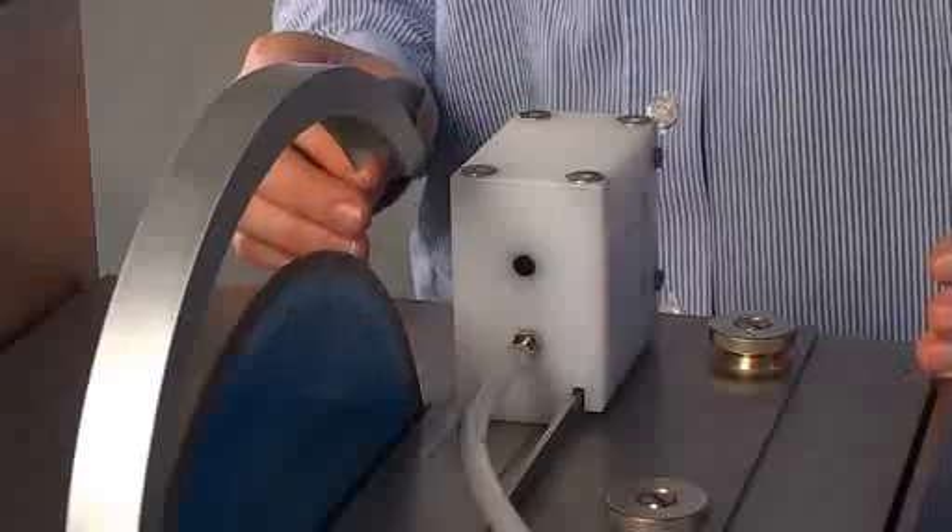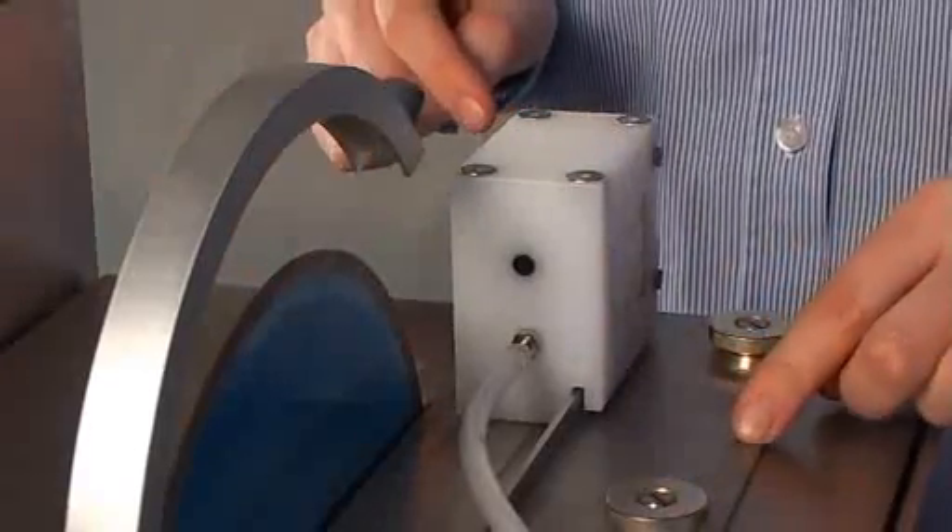The machine consists of a cutting section and a grinding section. The cutting part of the machine consists of a diamond saw, a two-sided vacuum holder, and a guide for the vacuum holder.